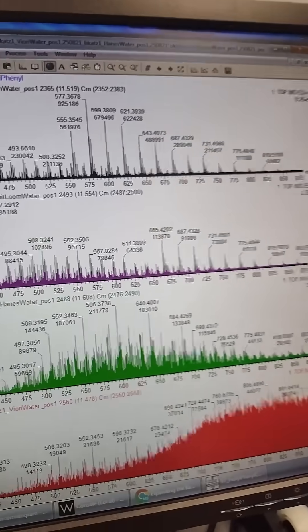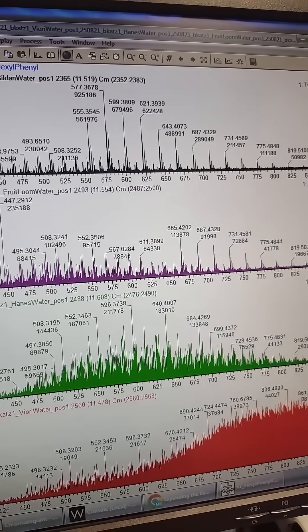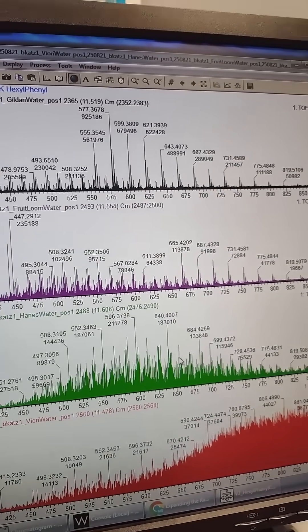Looking at it based on intensity, the Hanes shirt does look like it's the lowest.